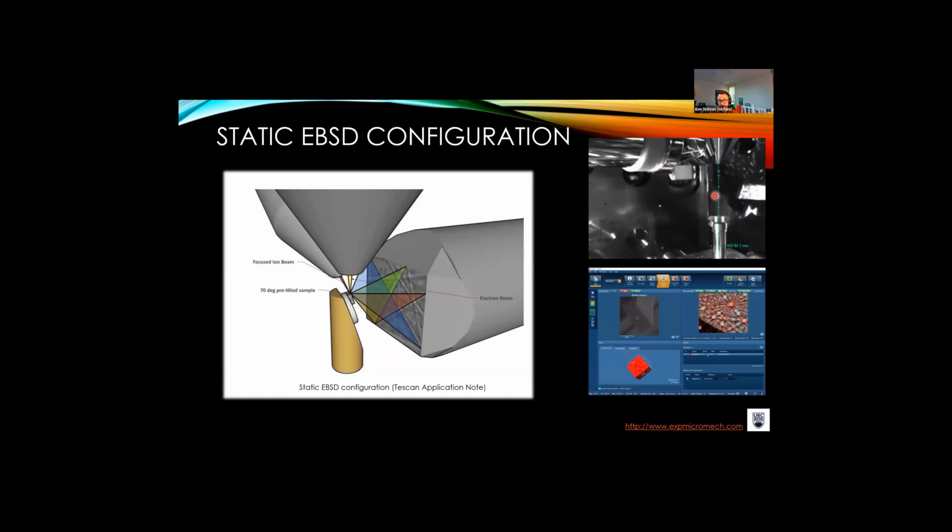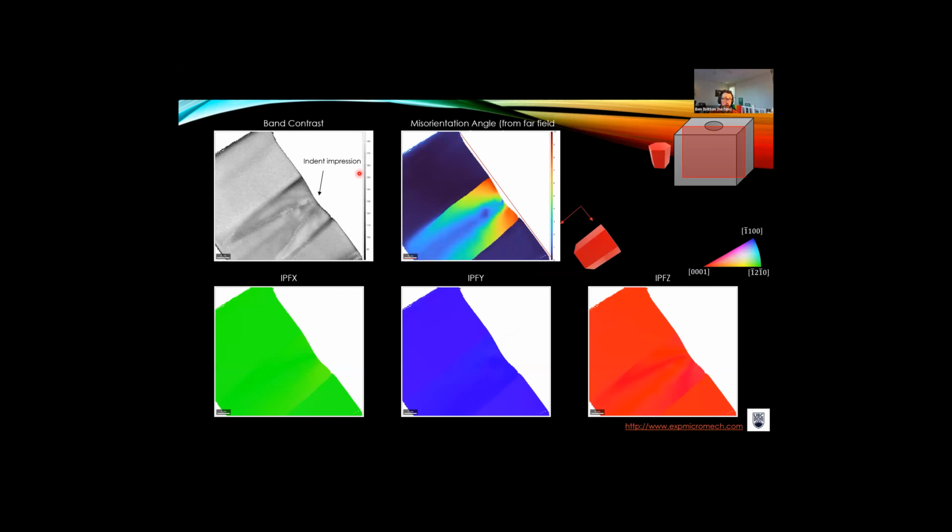This is sort of how it's set up before the sample was raised upwards. And then this is the experiment operating in the Oxford Instruments software. So we can see the sample and the angles, etc. Just for the way the 3D setup, we have it aligned in this slightly odd setup, but that's just for the geometry. But we have the indent was running this direction.